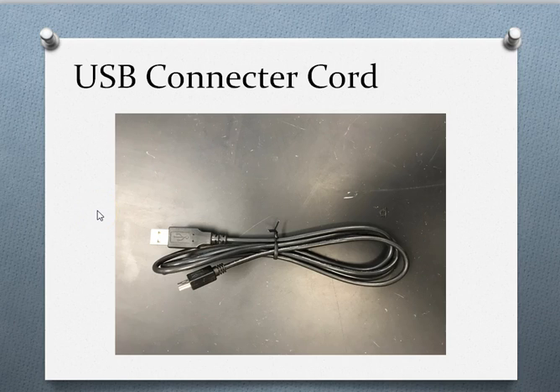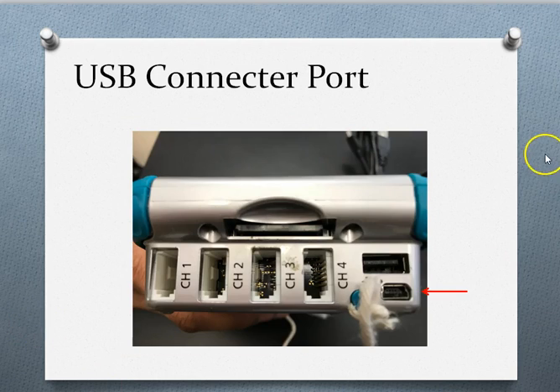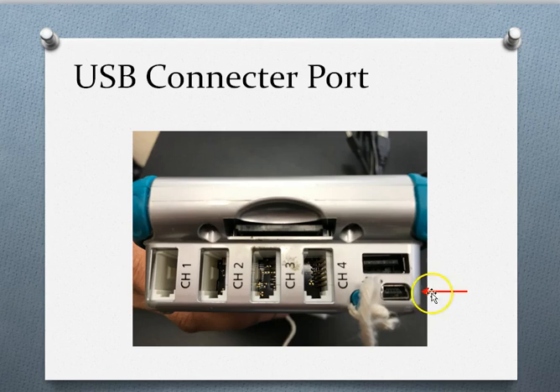The last cord is your standard USB connector cord. There's the USB part that goes into your Chromebook, and the other end is called the micro USB — I believe — which goes into the LabQuest. That same spot near channel one where you had your temperature probe — over here is the micro USB port, which looks a lot like the port that hooks up to a cell phone. See the arrow pointing to it? You would hook the micro USB end up there.